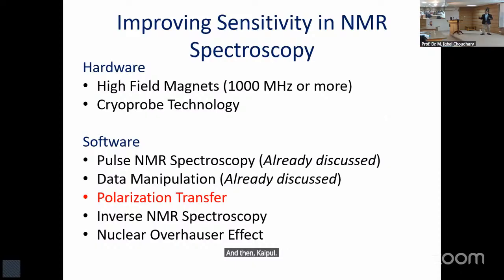The probe which my colleagues have actually shown you, which is everything except the magnet. Everything except the magnet is in the cryoprobe, in the probe. Your detector coil, your radio frequency oscillator, your sample place, everything. This is your spectrometer, right? Except the external magnetic field, everything is there.